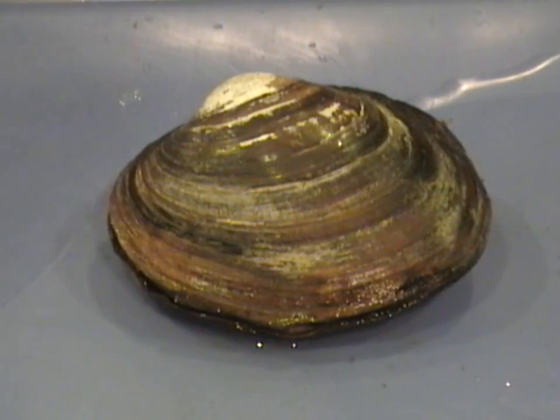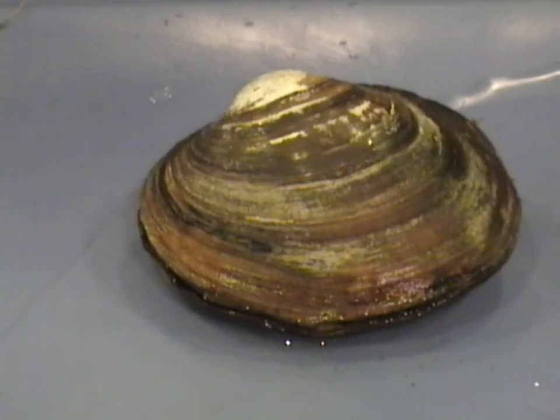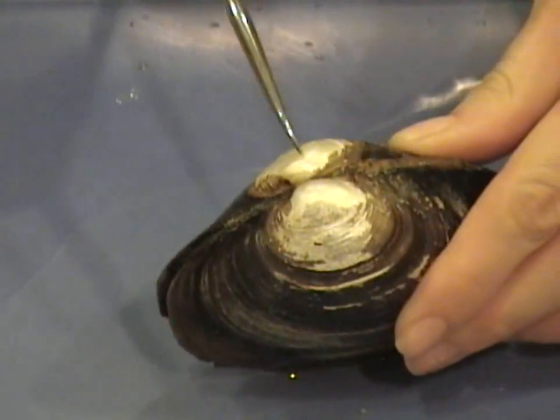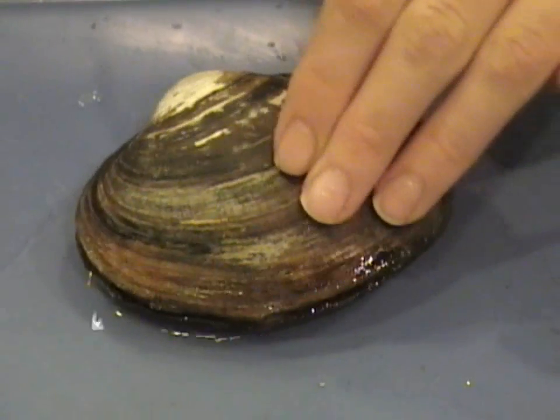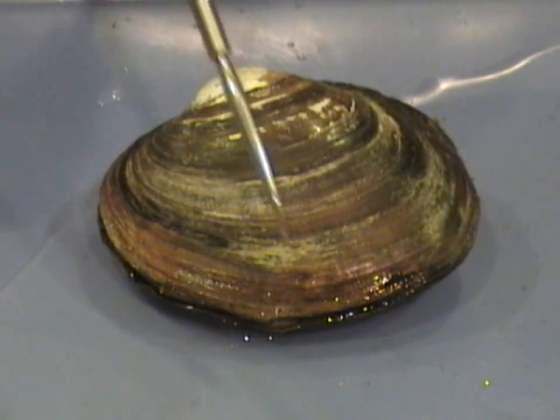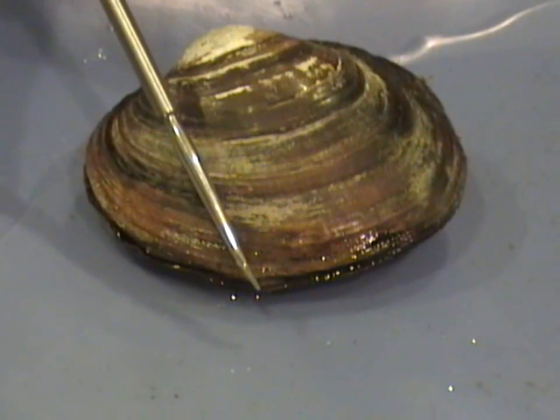The first step of a dissection is to orient the organism. In order to do so, we're going to first locate the umbo. The umbo is the oldest portion of the shell. The umbo also indicates the dorsal end. Directly below it is the ventral end of the bivalve.